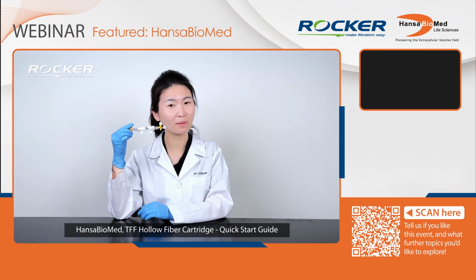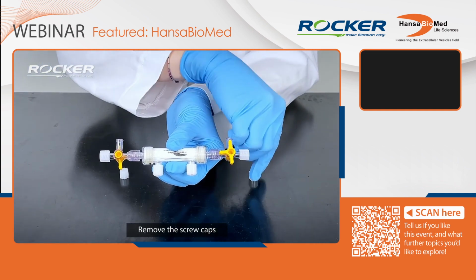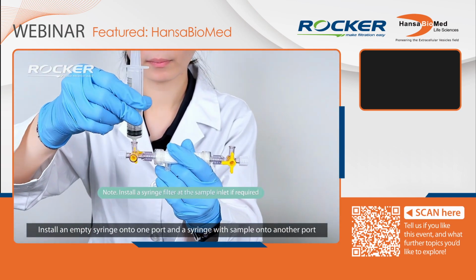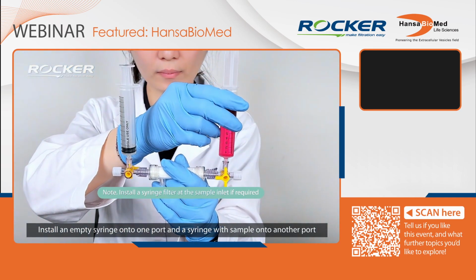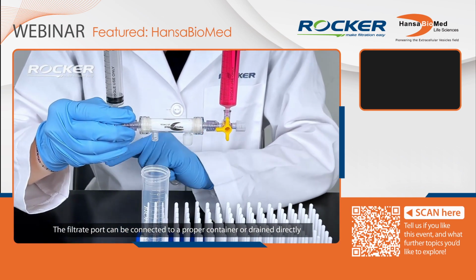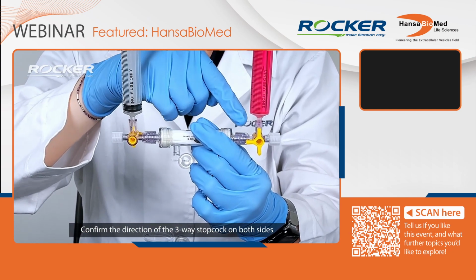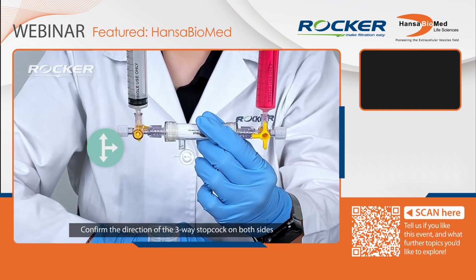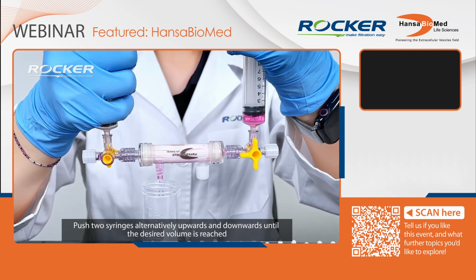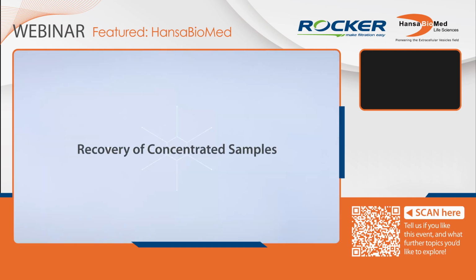HansaBioMed TFF Hollow Fiber Cartridge, Quick Start Guide. Remove the screw caps. Install an empty syringe onto one port and a syringe with sample onto another port. The filtrate port can be connected to a proper container or drained directly. Confirm the direction of the three-way stopcock on both sides. Push 2 syringes alternately upwards and downwards until the desired volume is reached. The filtrate will be collected into the container while concentrating.